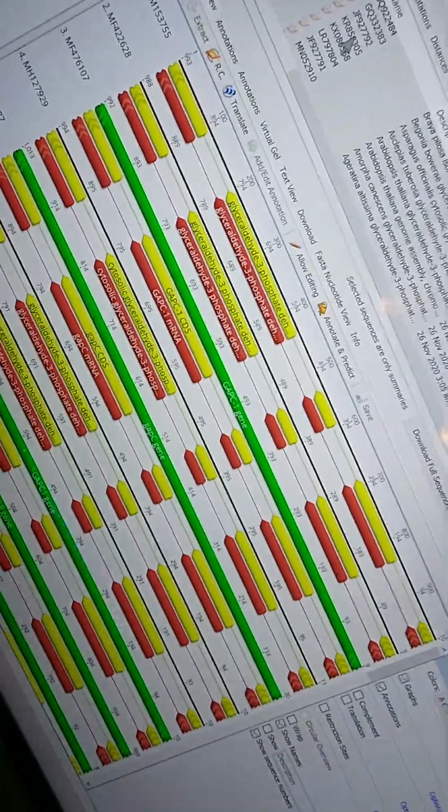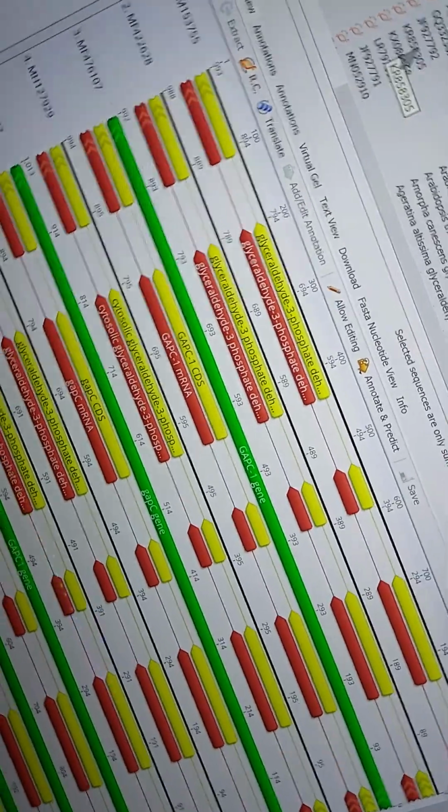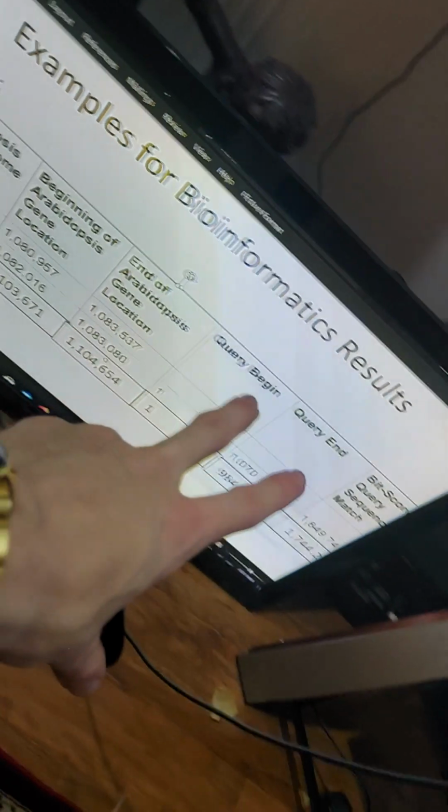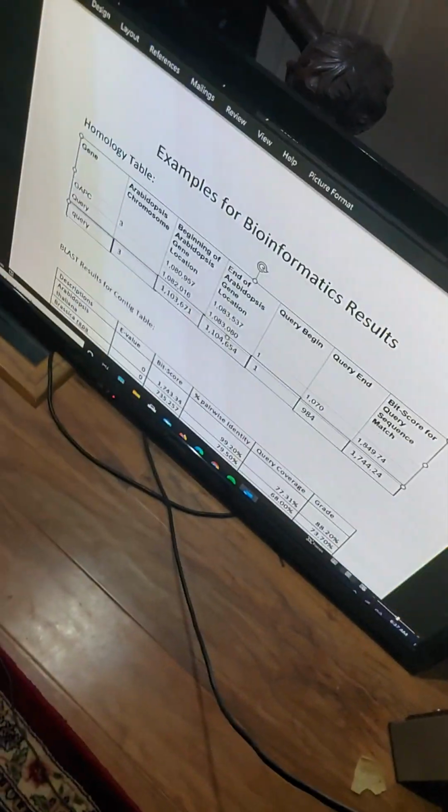However, if you move this over, just give me a moment, you can check the contiguous nucleotide collection, okay? So this shows in the contiguous sequence all these different plants. So if you go back to this, if you remember these where we have the, hold on, actually that's the wrong graph.